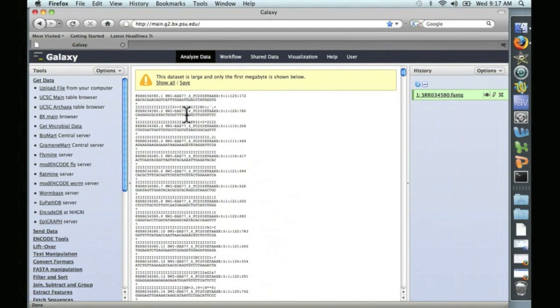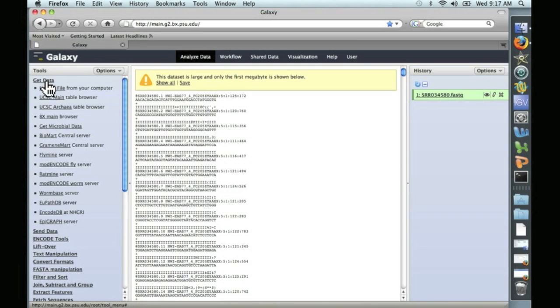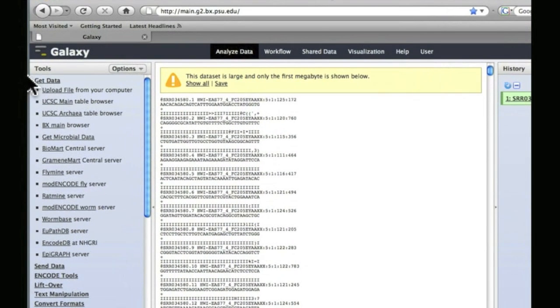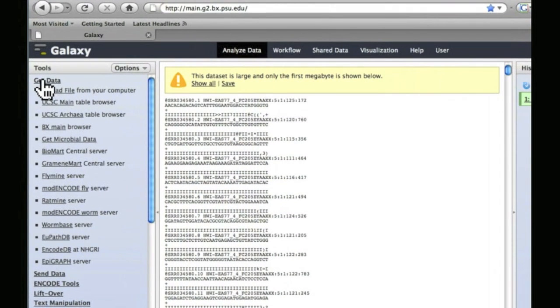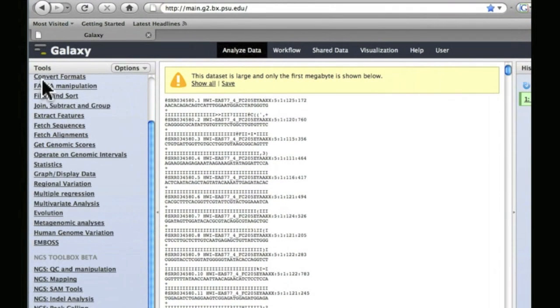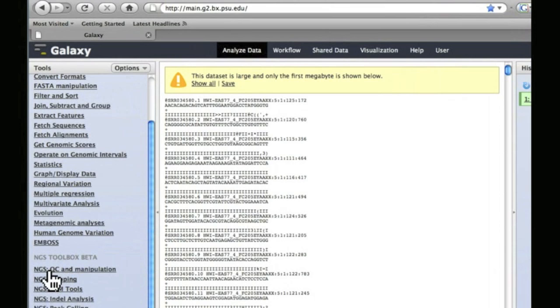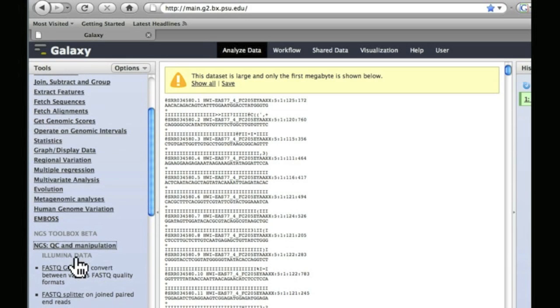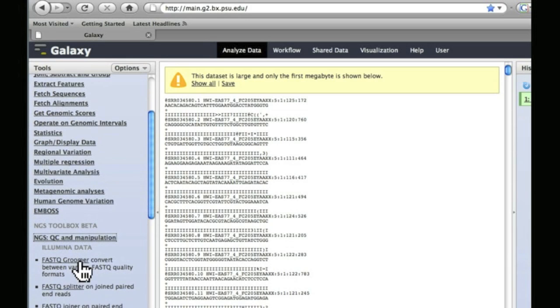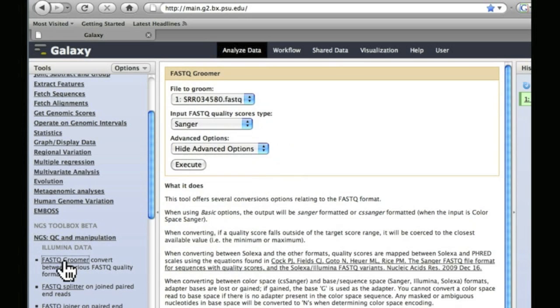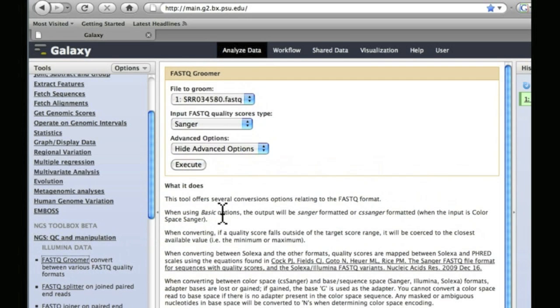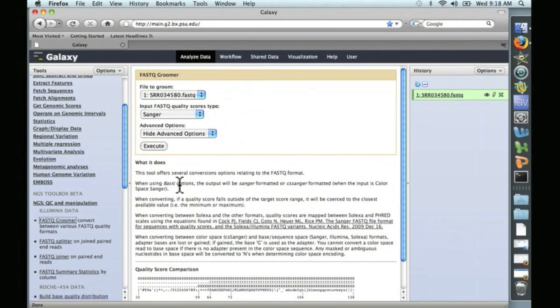However, before this data can be aligned, it needs to be processed in a form that Galaxy uses for alignments. And to do that, we're going to close this Get Data window. We're going to scroll down here to Next Generation Sequencing, QC and Manipulation. Click on that. And this first option, FASTQ Groomer. Go ahead and click on that.